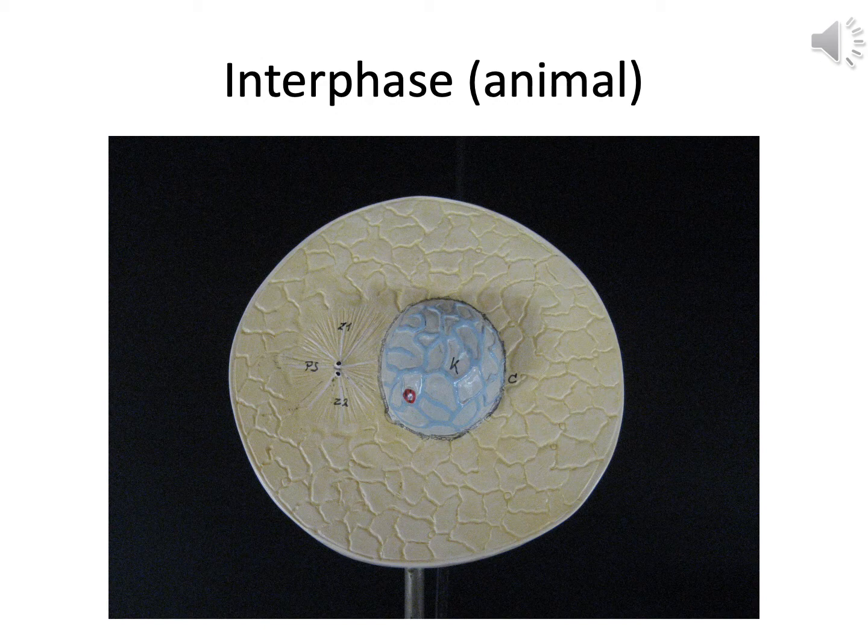Eventually, when the cell gets ready to divide, it will replicate its chromosomes, and there'll be 4 copies of every chromosome, 2 from mom and 2 from dad. Those would be usually the chromatids, but they are replicating. The nucleoli is visible. See, there's a little red dot in the center? That would be the nucleolus, the site of RNA manufacture. Because the cell is doing normal things, it's producing all its proteins, it's making all its RNA and producing proteins, and everything's working just fine.